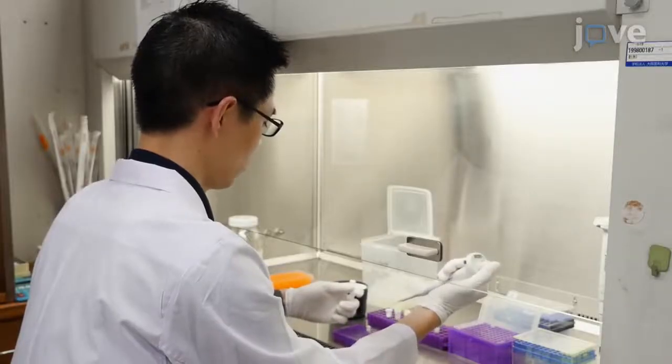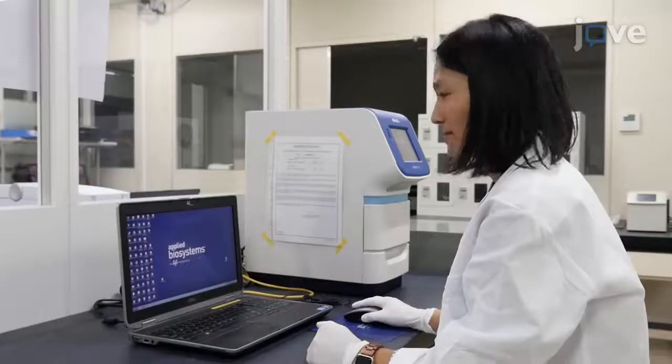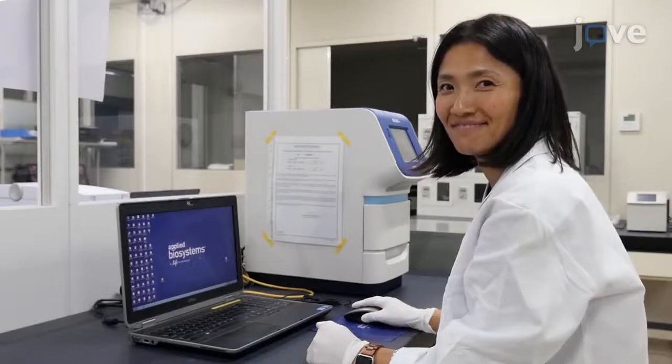Demonstrating the procedure will be Shou Sakaguchi, an assistant professor, and Aki Noemi, a technical assistant from our laboratory.